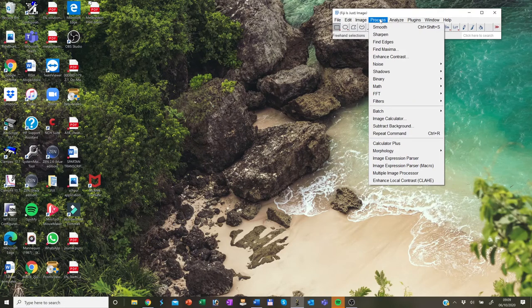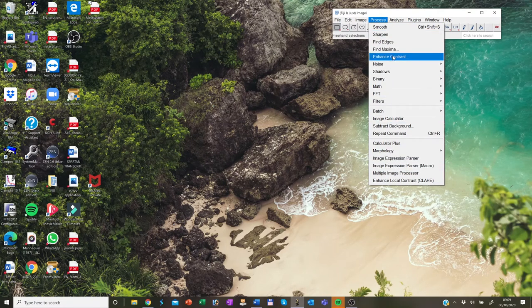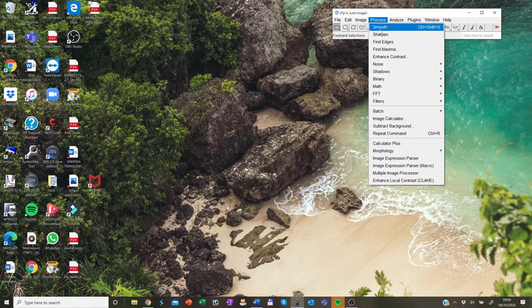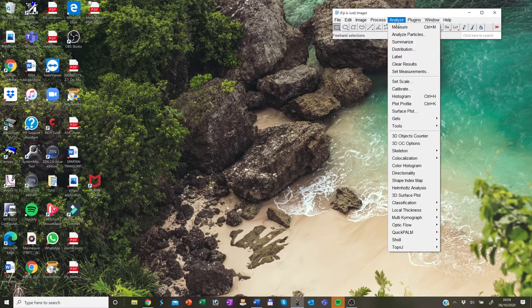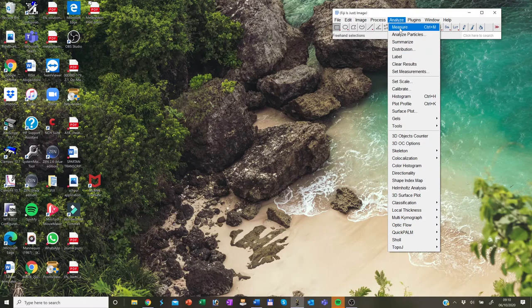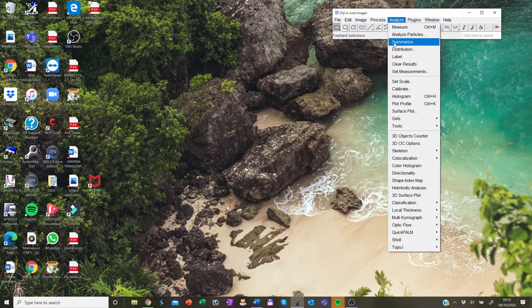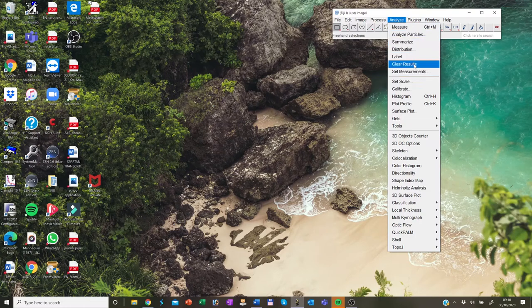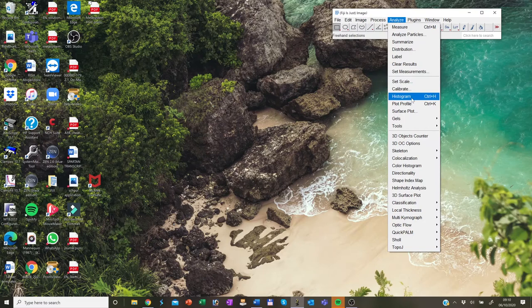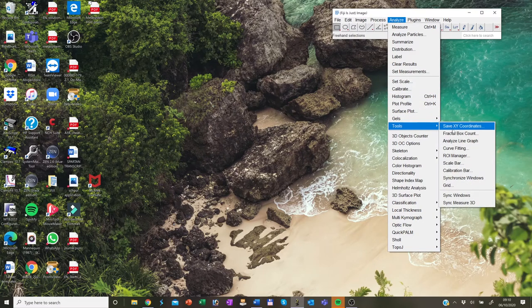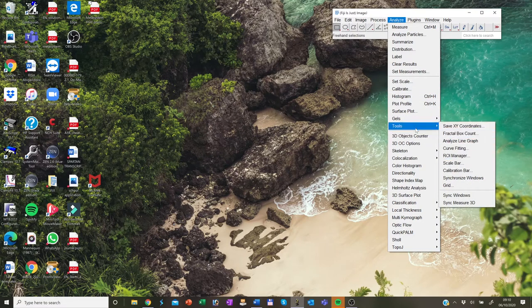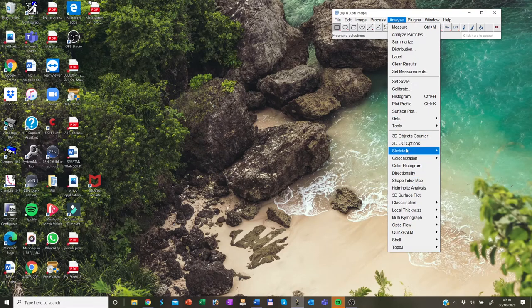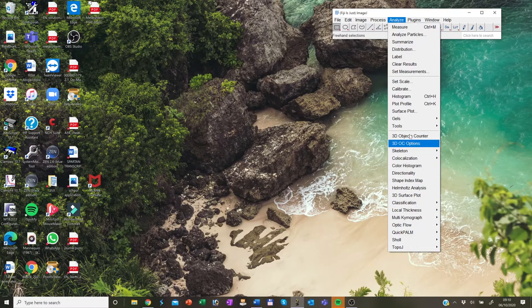In the process section, it contains all the image filters that you may use during your analysis. In the analyze section is quite important. It contains all the information and the possibility to do the statistical analysis on your images. You can also set the scale and look at the histogram and use different tools and all the other useful plugins down here.